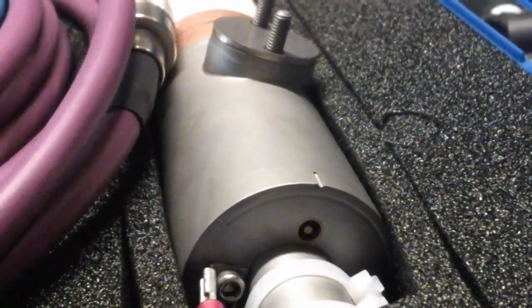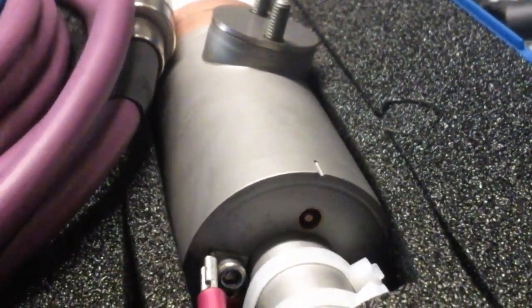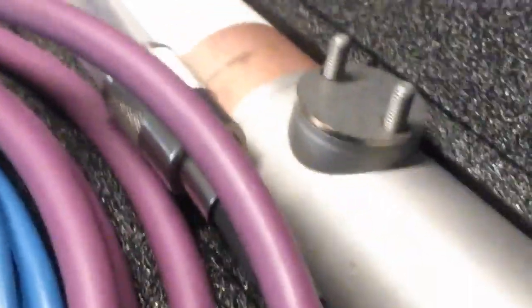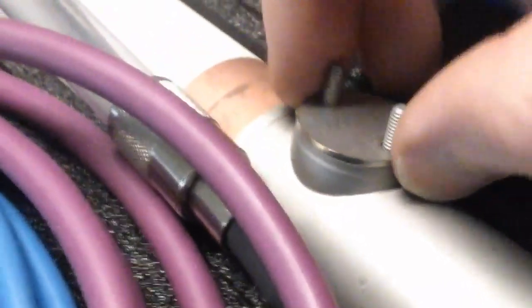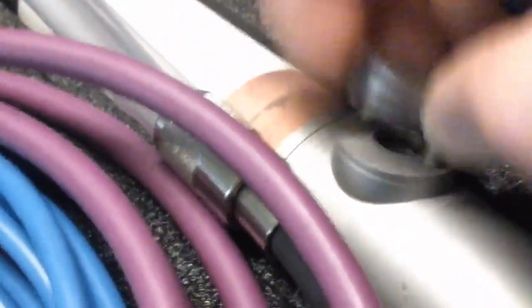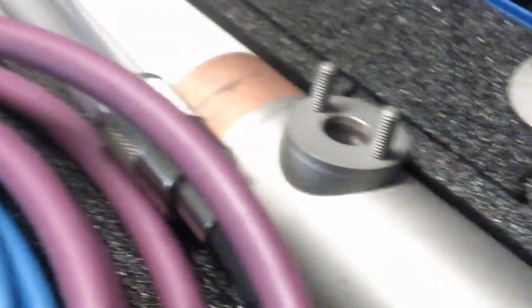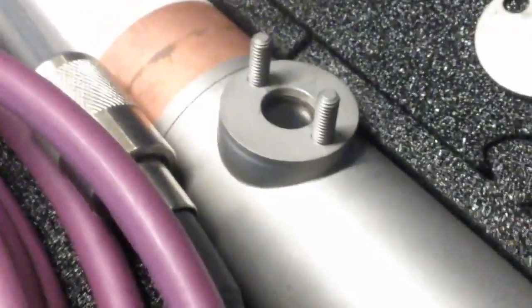Right here is the exit window of an x-ray tube. And right now it's covered with a small shield. It adds a molybdenum plate. Underneath you can see the beryllium window.